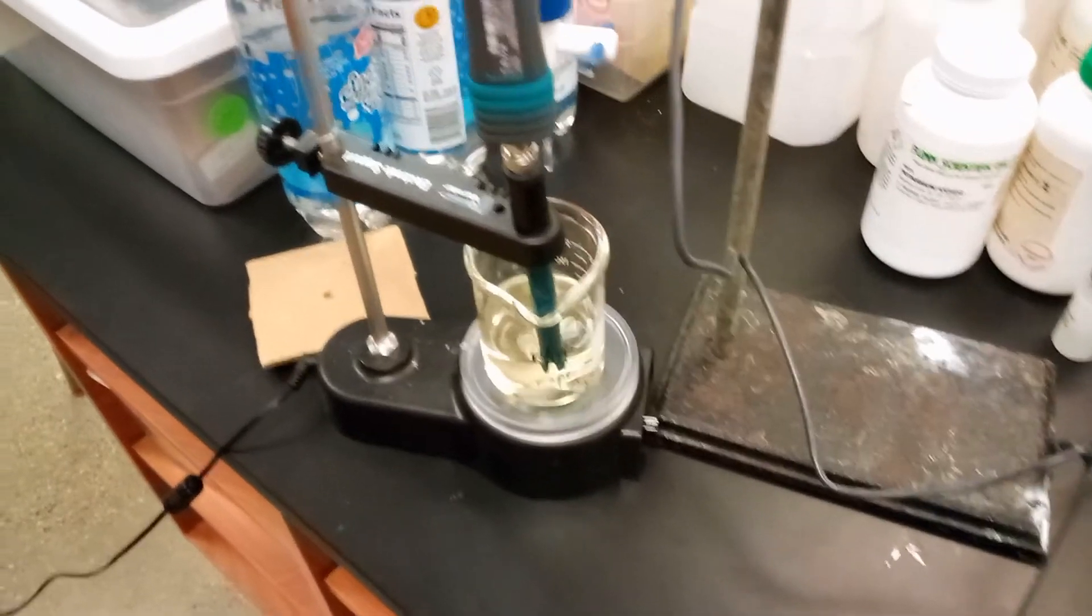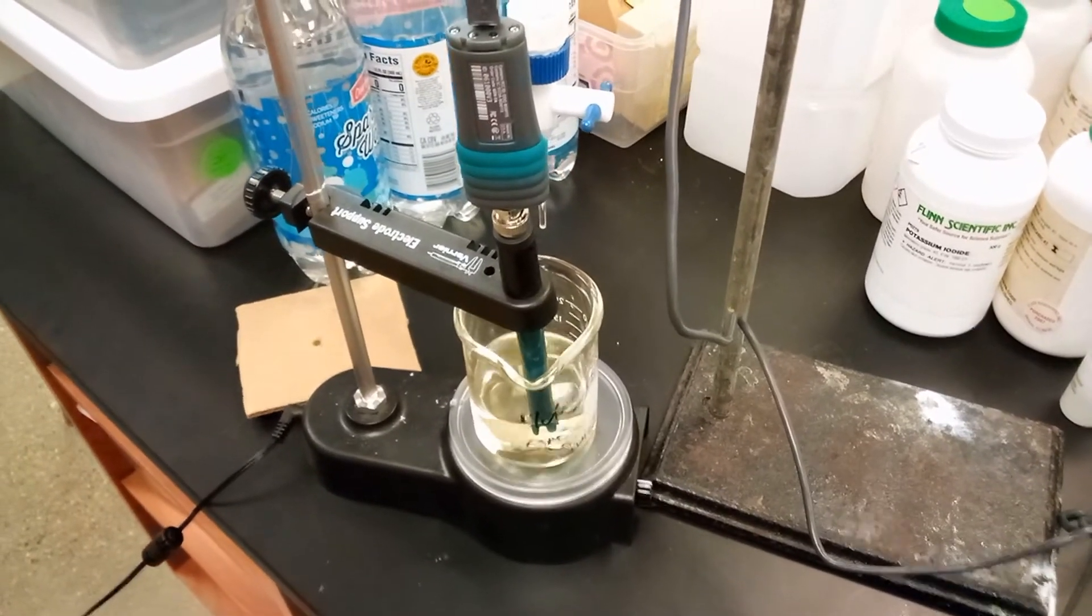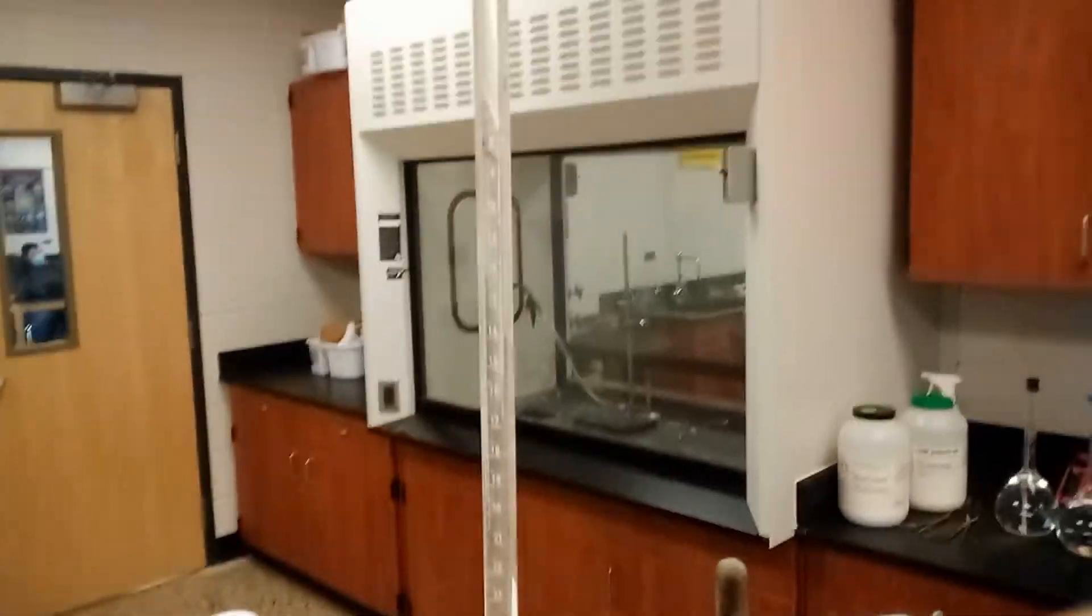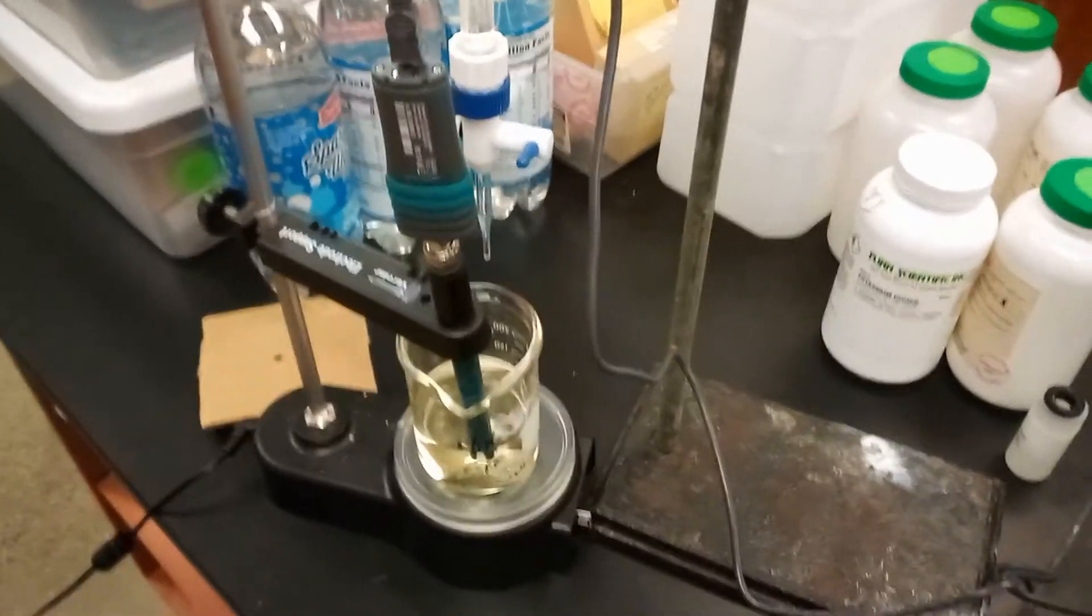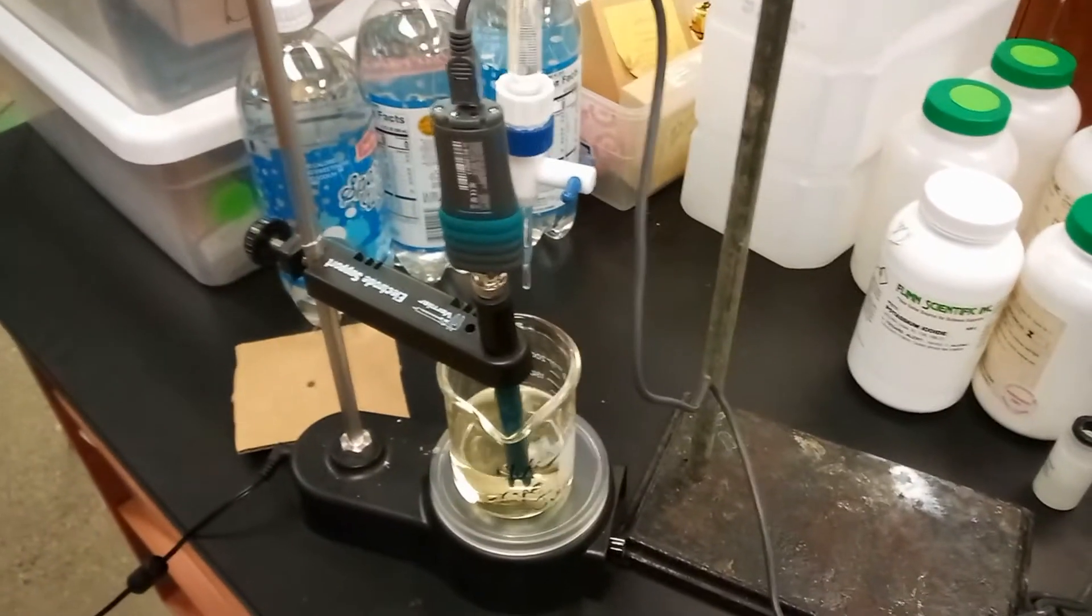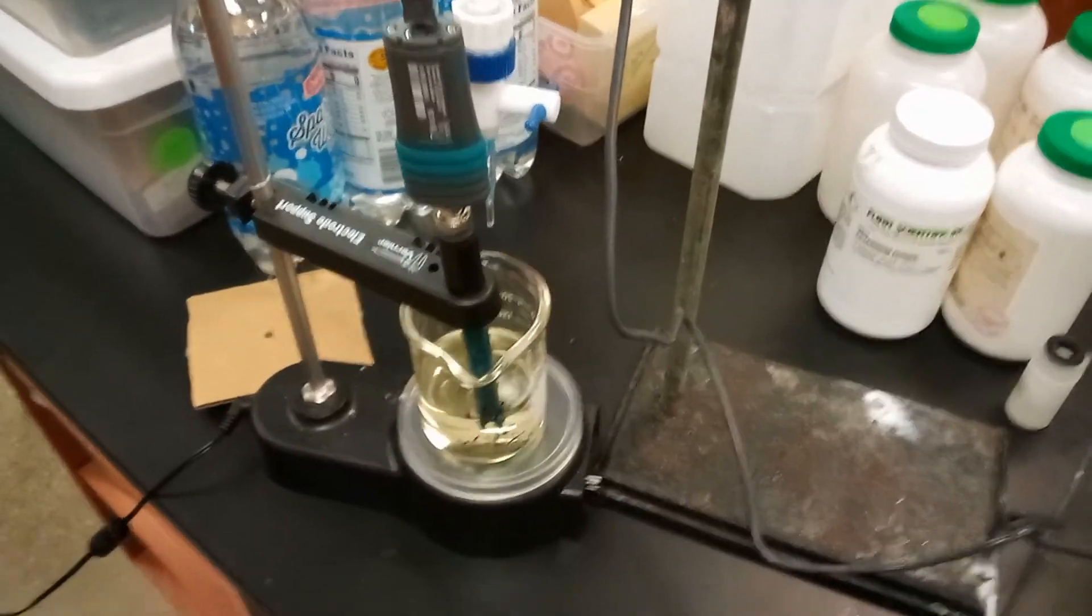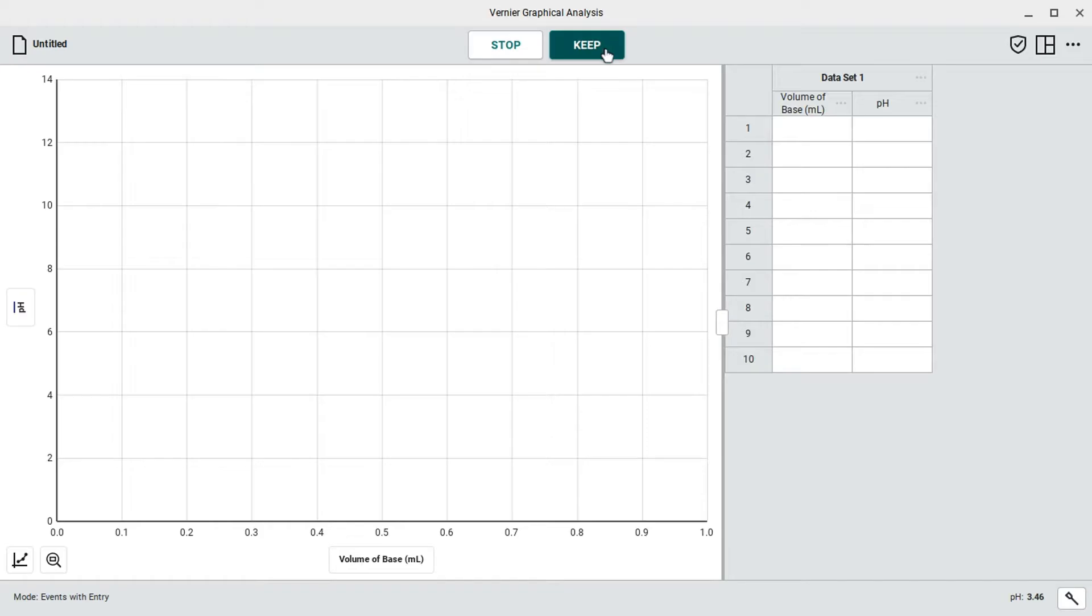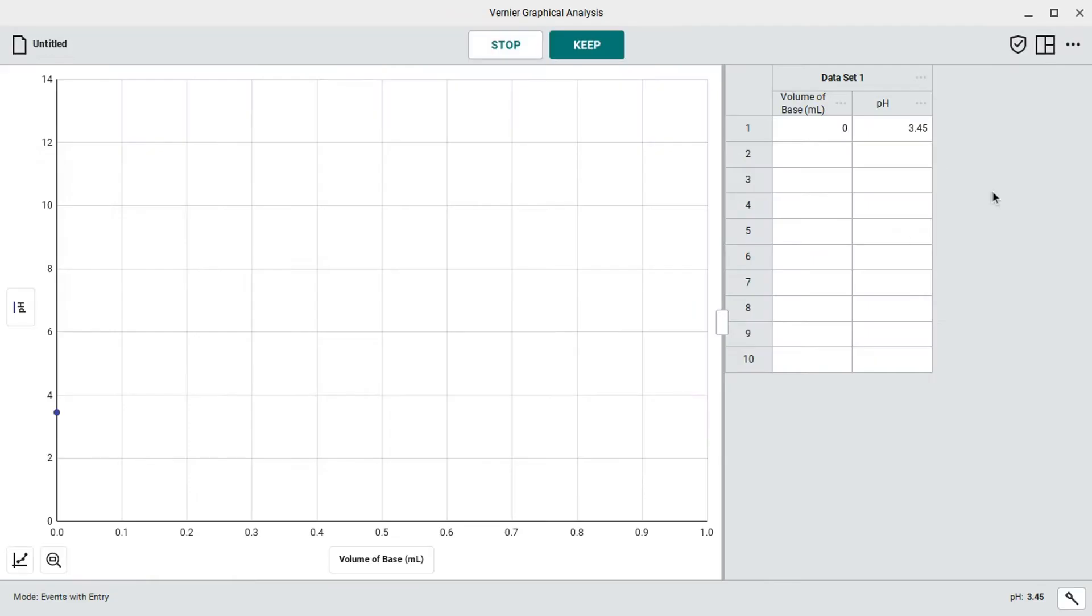And we'll now be putting the pH probe into the juice. Here you can hopefully see that we have the pH probe into the juice all set up, as well as the burette filled up, and a computer with graphical analysis up and running. So the first data point that we're going to collect is the zero milliliter mark, obviously. So we got the zero milliliter mark of the base that we've added, zero milliliters. We're going to go ahead and keep that point at 3.45 on the pH level.